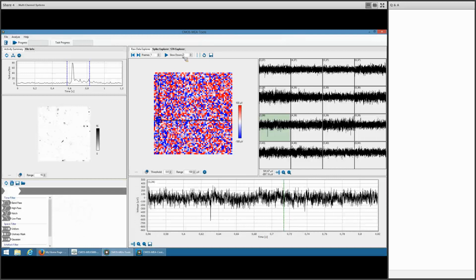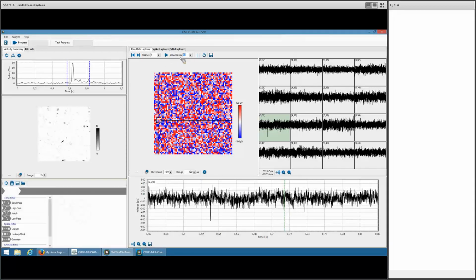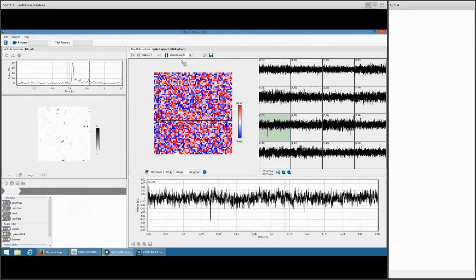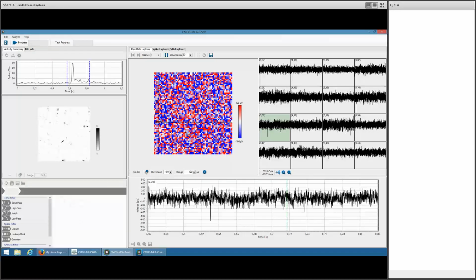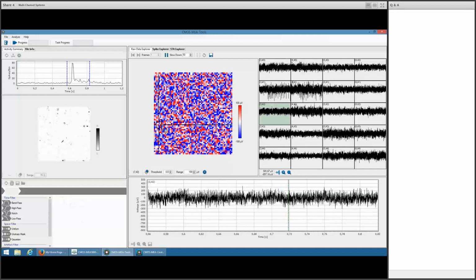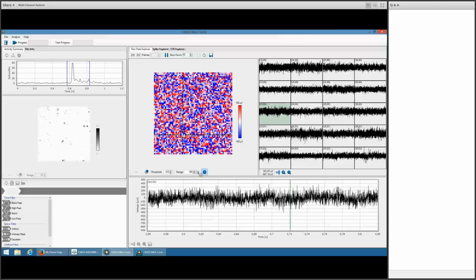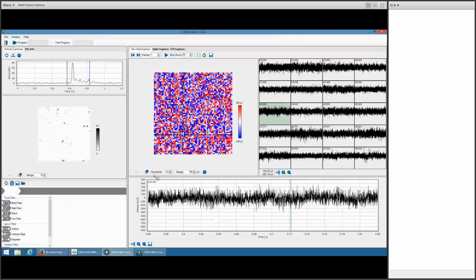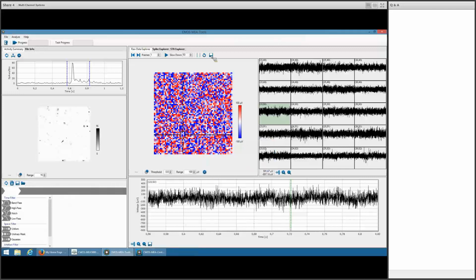So that was a bit fast to really follow. So you can type in a delay to make the replay slower, even a bit more. So that value that I'm typing in here means add 50 milliseconds after each frame to make the display slower. And now I can wait for the spots showing up. Of course, I can also use a different scaling.